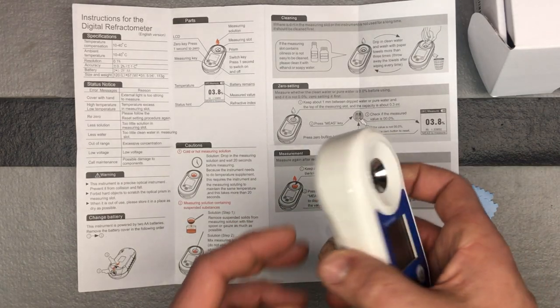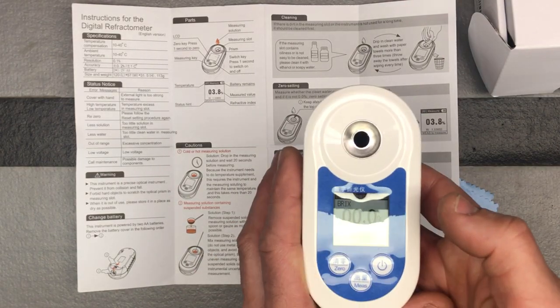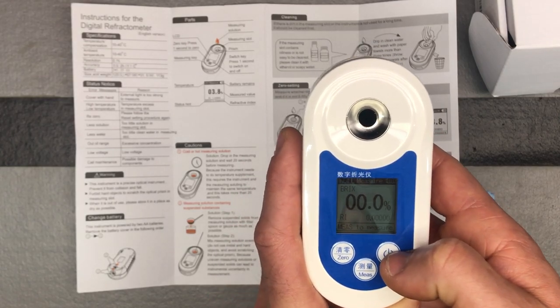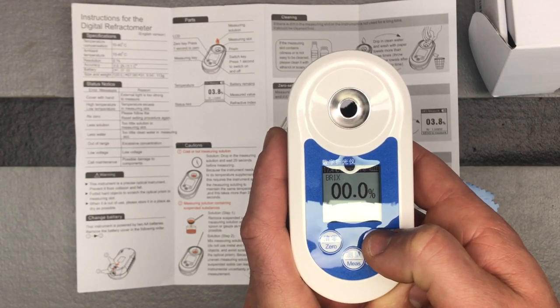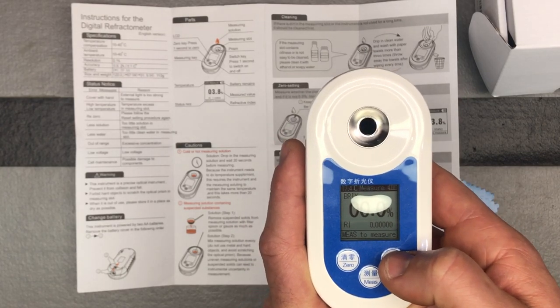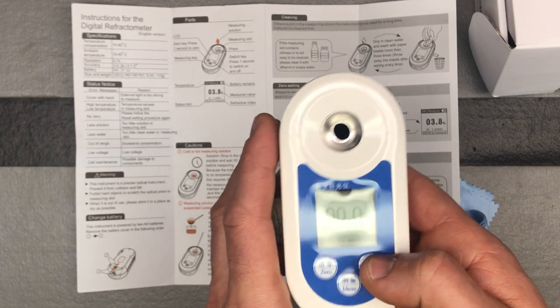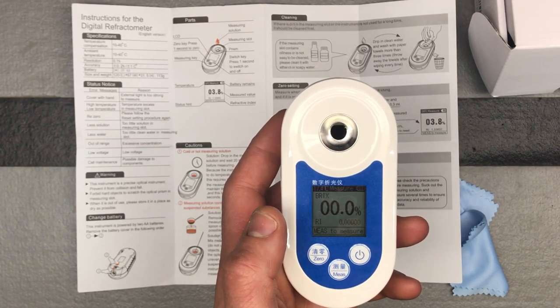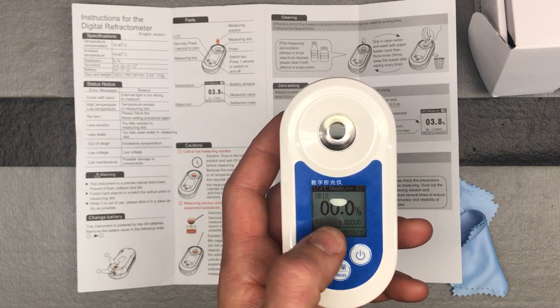It'll be interesting to see how much sugar is in different things you don't even think about. We'll do some measurements and I'll show this in action. Again, it's a digital Brix refractometer, and the brand is LNICEZ instruments.